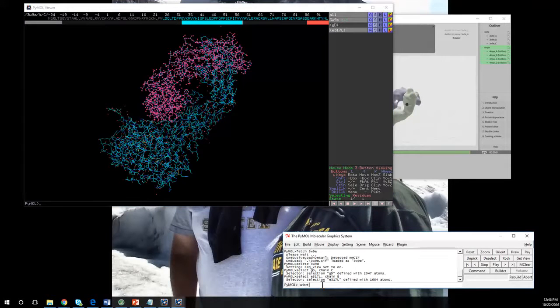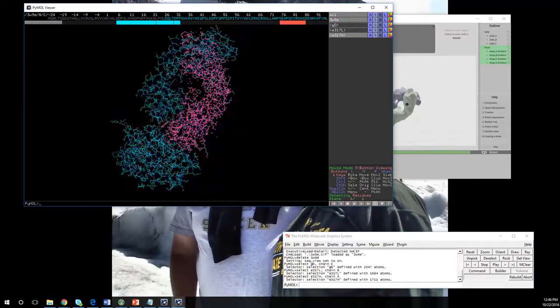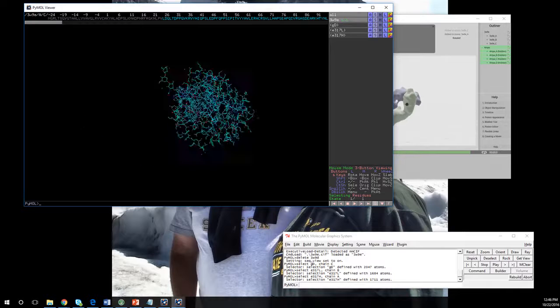Select E317 heavy as chain A. Okay, so now that's labeled up there. Now I can just very quickly hide everything, and it'll hide that molecule. If I click and highlight it, it'll kind of show where it's at. This is selection. If I click off it, that's going to go away. So if I'm in E317 light chain, I can hide everything. And now I only have the GD molecule here.